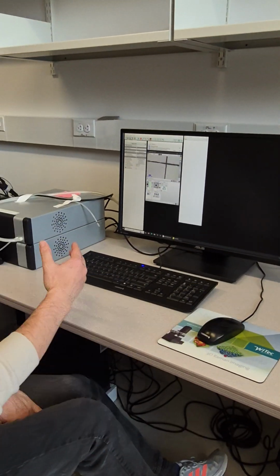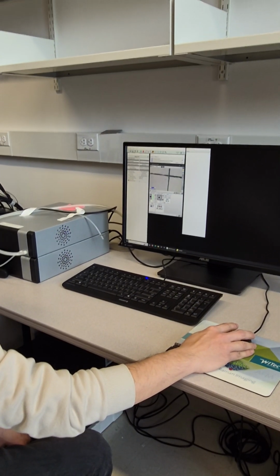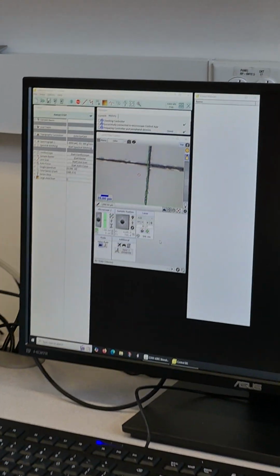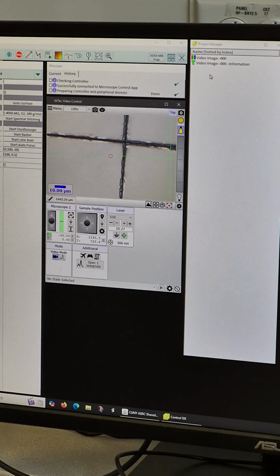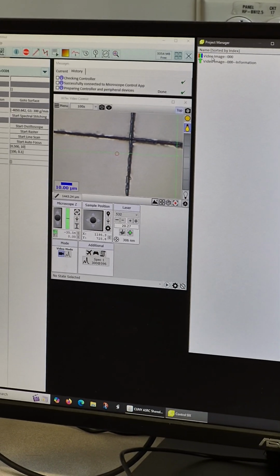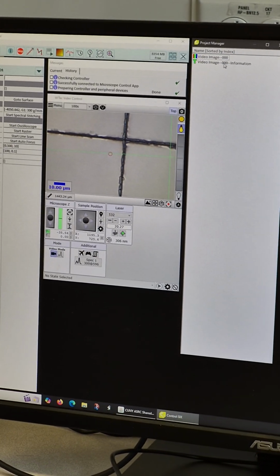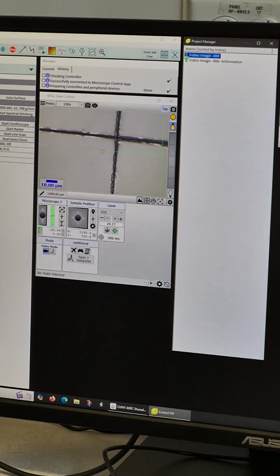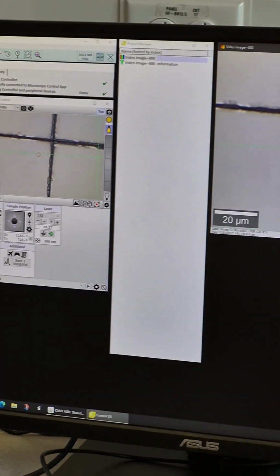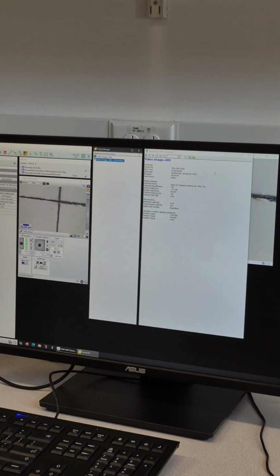Okay, so now we have the image, and this is live, and you can go over here and take an image. So now you will have image data in the data tree. Every data you collect with this software always gives you two items in the data tree. The first one is a real image. You double click, it gives the image. See, it's the same as this one. The second one is a text file. It's a header of this image file. It's just saved separately.